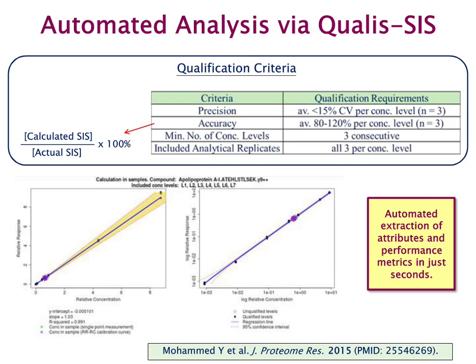Apart from the automation and speed of processing the data for curve interpretation and results extraction, I personally like to interactively examine the data when changing various analysis parameters, such as the threshold for precision accuracy criteria or changing the calibration level removal strategy. Altogether, this streamlines the comparison and enables the final analysis parameters for a given assay to be more rapidly defined. The development of the Qualis-SIS quantification software has recently been published by Mohammed and co-workers, and all the details can be found here.